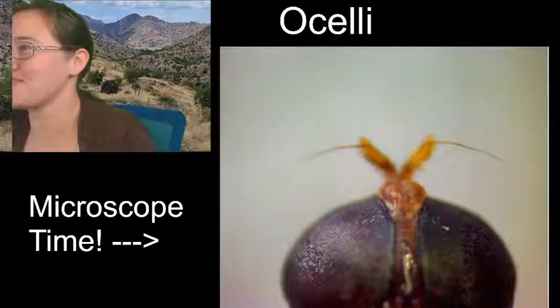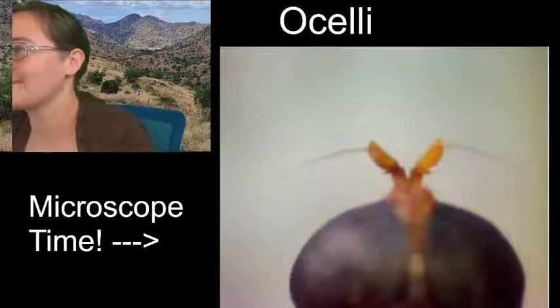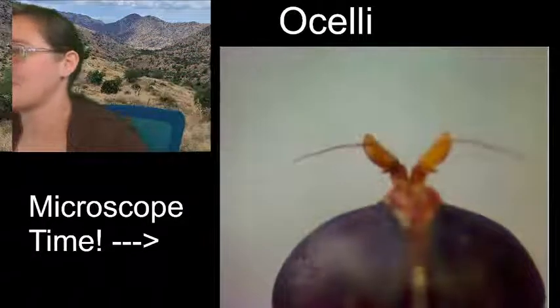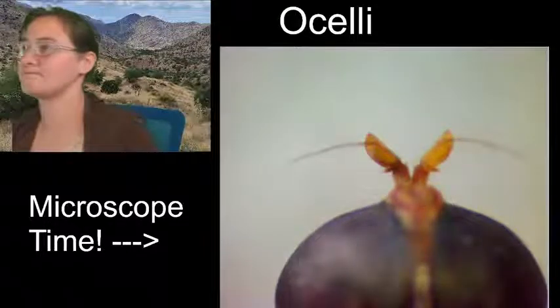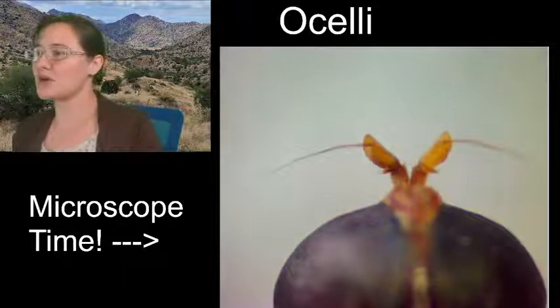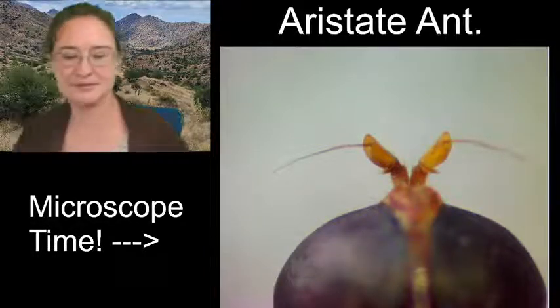Alrighty, yay! We can see the antenna. So, these are what we consider aristate antenna.